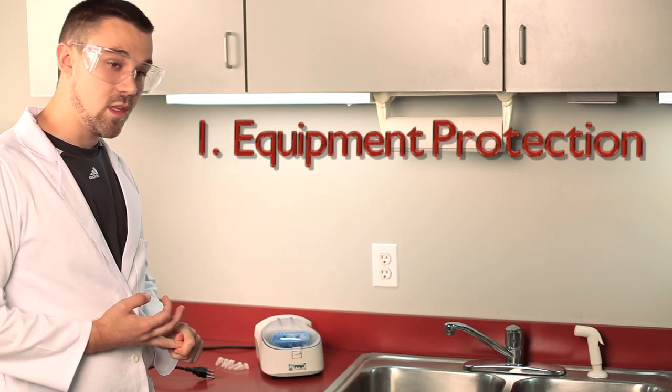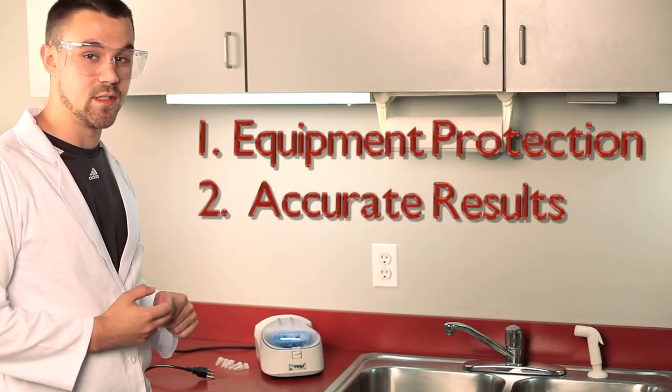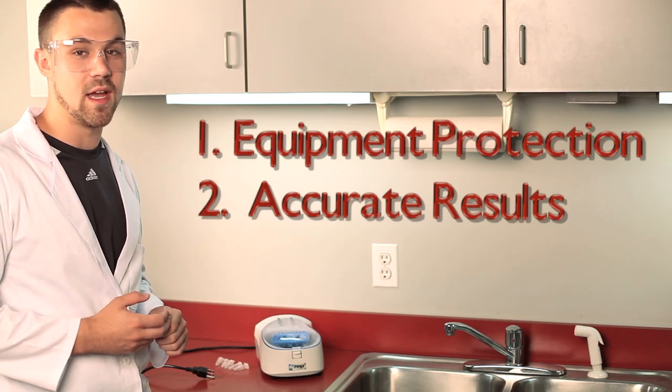Secondly, you want to obtain optimal results. If it's unbalanced and it's spinning like that, your results are not going to be accurate.